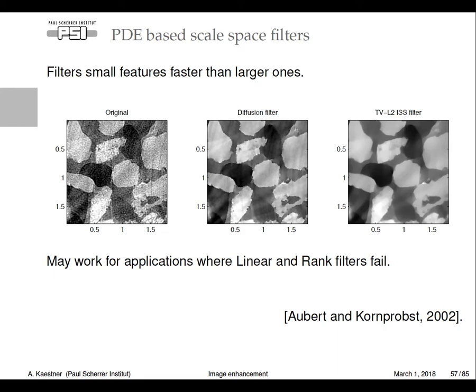And the purpose of these filters, they are very well at preserving edges. So you can see here, for example, these edges, they're pretty sharp still. And getting it that sharp with so strong filter effect is not possible with convolution filters. Also median filters wouldn't do it. But maybe you may think this is maybe a little bit too smooth. Here is another alternative which has a little bit more edge roughness maintained. But again, it's a question of what you want to achieve with the filtering, how hard you can go with this filtering.